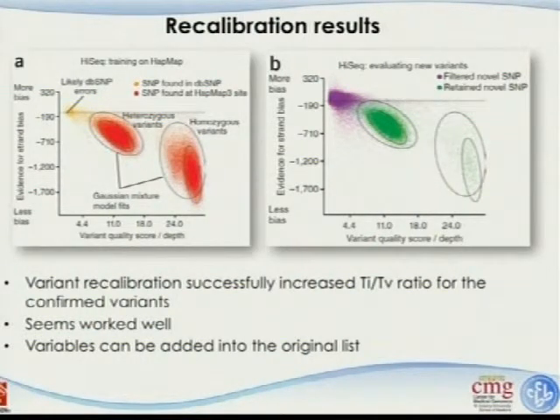There will be some equations associated with that. But the point is, when they use a new sample, they sequence the sample and go through all these hassles. Eventually, for each variant, they calculate a variant quality and all the other variables, and then put that into these machine parameters.